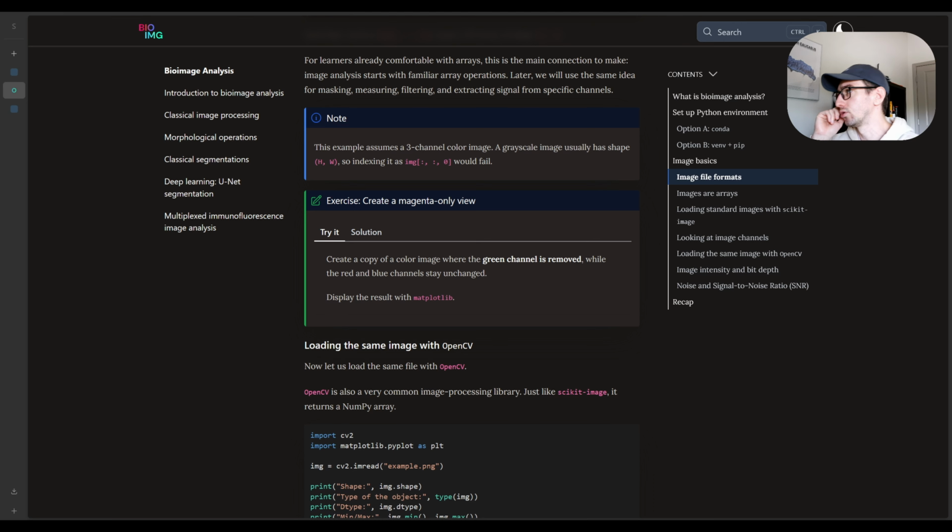Okay, Artem, can you share your solution in the Telegram channel and then explain it? I'll put it on my screen so that you can explain what you did.